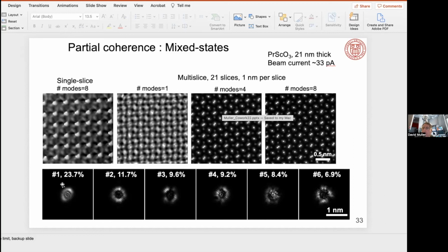And so it's the in-focus ptychography. We didn't have to do the multimodal decomposition when we were in focus. When we went out of focus, it was very important. It wouldn't reconstruct without that. So, that is sort of a lesson of, there's a lot of bad things that are folded into the multimodal decomposition that it's correcting for. And sometimes it takes a bit of detective work to figure out which are real decoherence and which are other artifacts that are being treated that way.